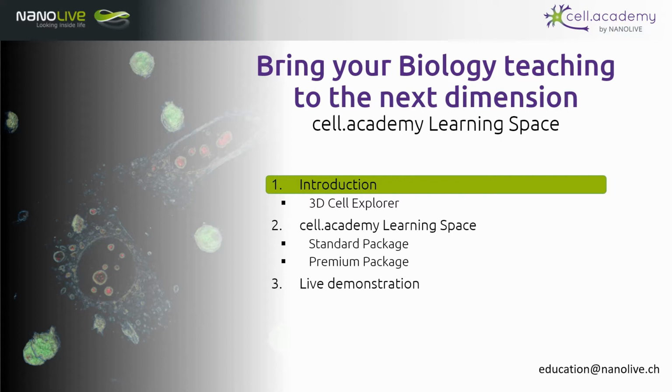lessons. In today's webinar, I'll start off with a brief overview of the 3D Cell Explorer, the microscope that has been created at Nanolive, because all the cell images on the Cell.academy learning space are taken with this microscope. I will then provide an overview of the learning space with its contents and examples of cell data that you can find on there. I will then do a live demonstration with our interactive software so you can see exactly how it works and you can see what the students are expected to do with it.